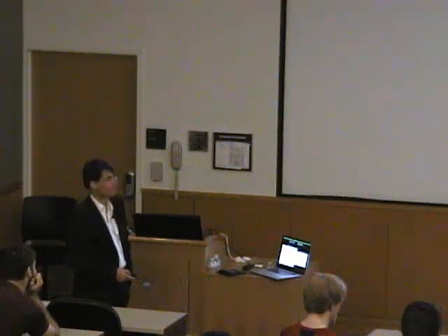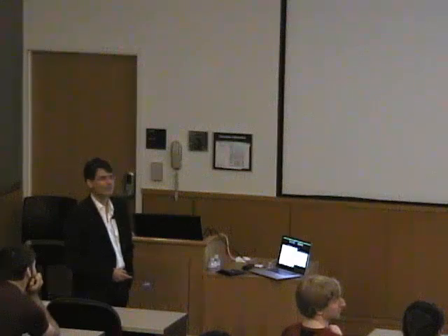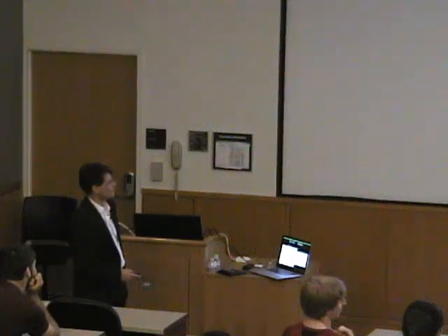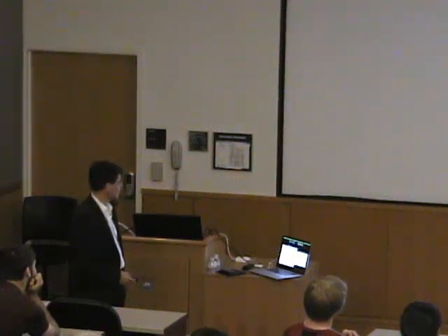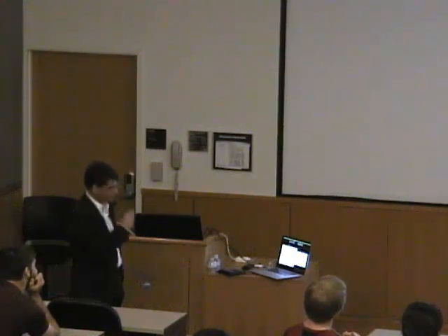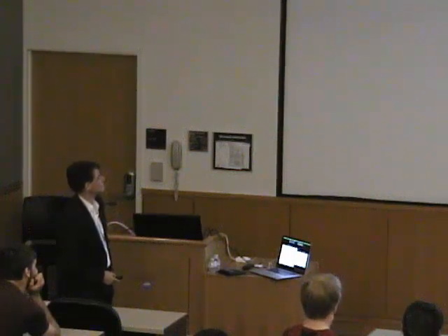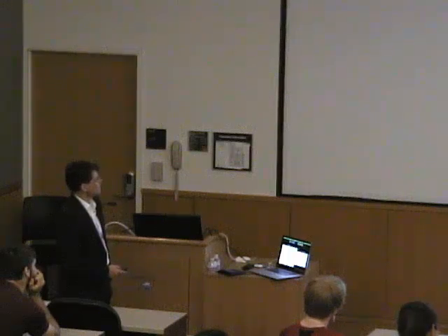But if you're curious and adventurous and you happen to like theory, which I don't know how many of you do, then this is a very powerful friend. So now I want to reiterate these points a bit and illustrate them with examples. These are the dimensions of an MCD experiment.